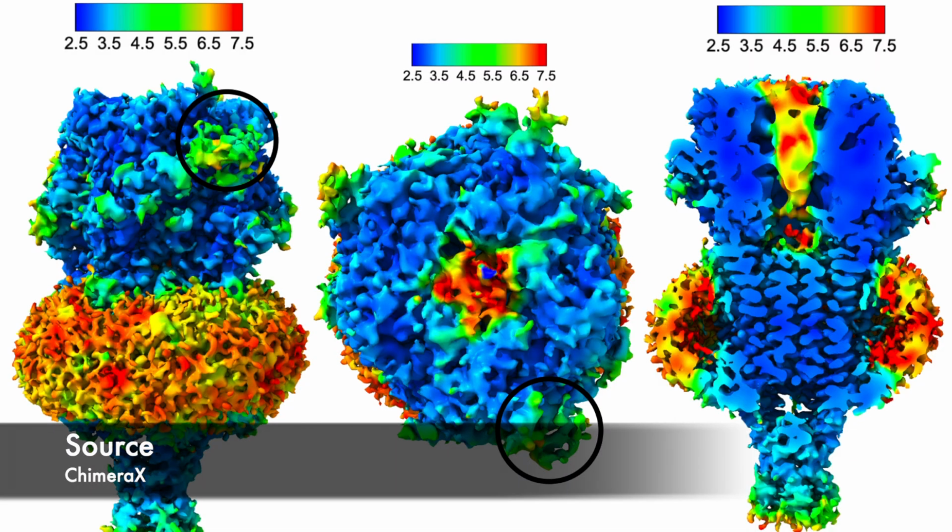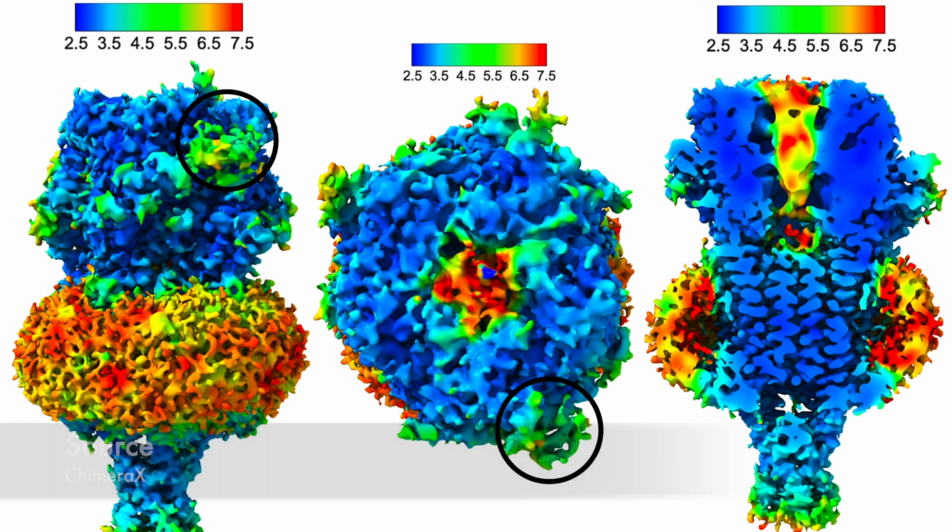Something to note is that circled here is the toxin bound to the receptor. If you remember from the second local resolution I showed you, the toxin was at around 6.5 angstrom resolution, whereas here we're seeing more of a 4.5 to 5.5 resolution. So we can see that we have improved resolution on this toxin binding.